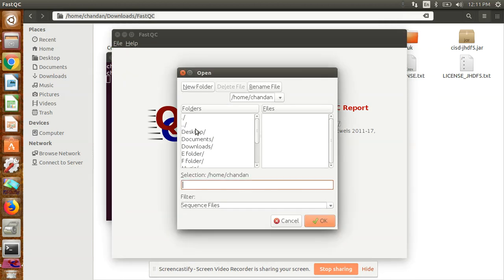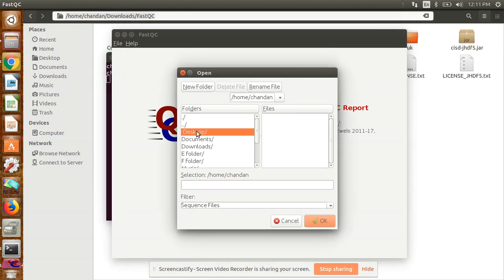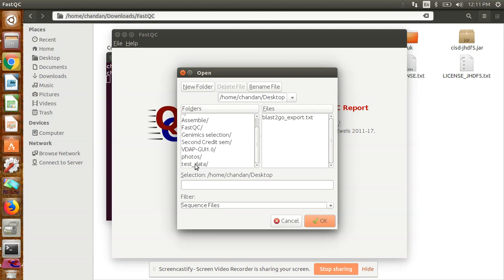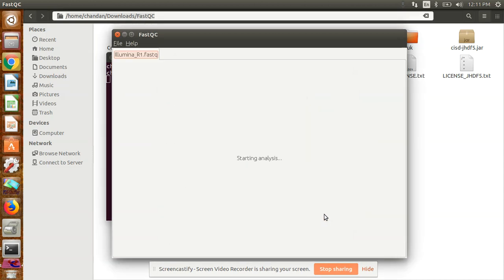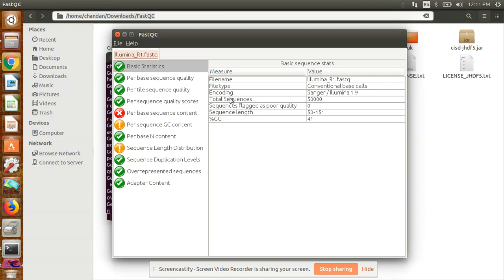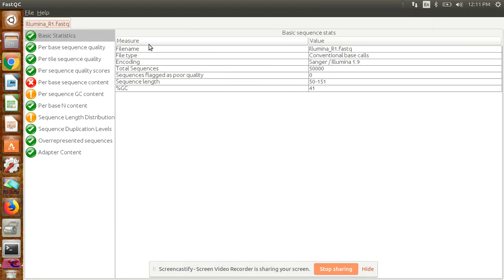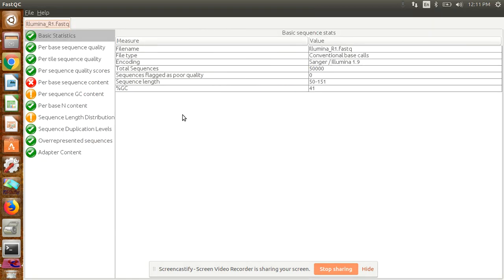You have to open your file wherever your raw sequence data is present. I have the data on desktop, so I go to desktop. This is under test data—the Illumina R1 for forward sequence. You can select that and simply open it.